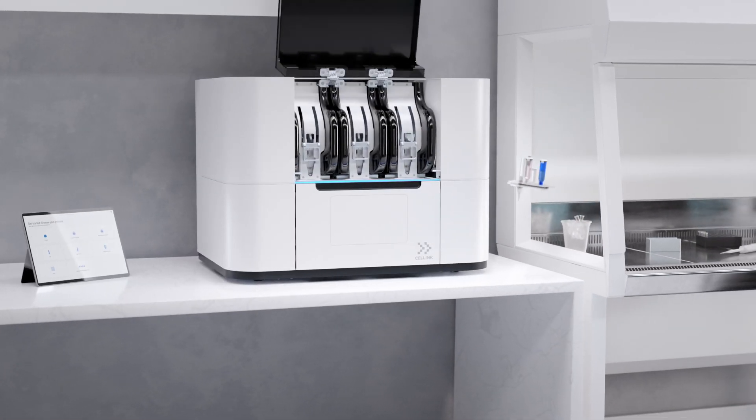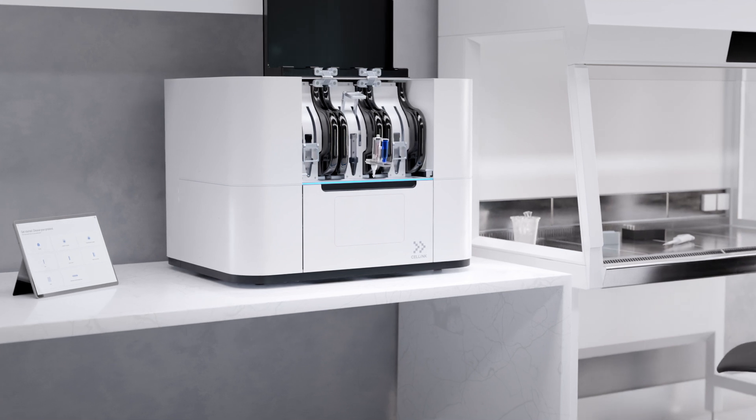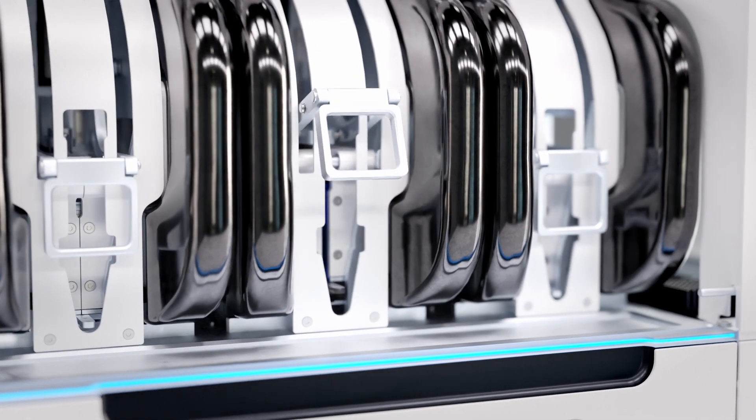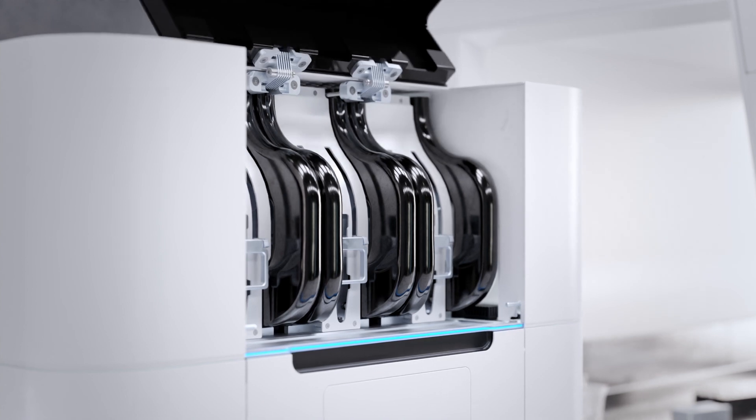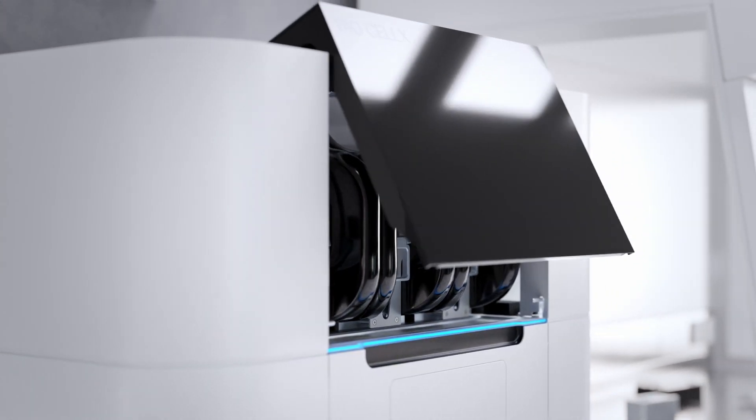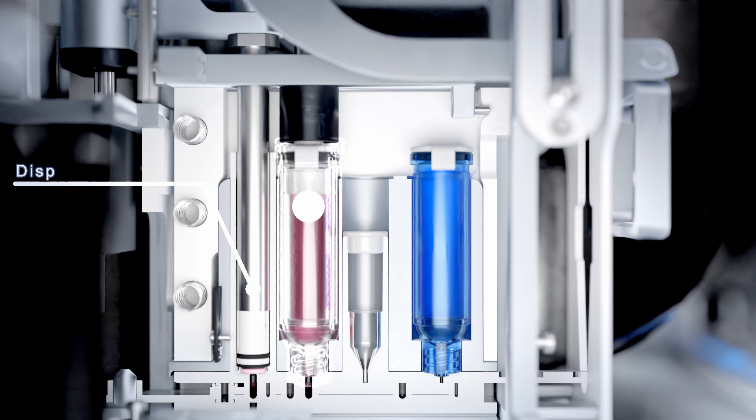With effortless preparation, the BioCellX combines the best in precision liquid handling with years of in-depth biofabrication expertise, enabling a high-throughput method for generating 3D cell-laden constructs.